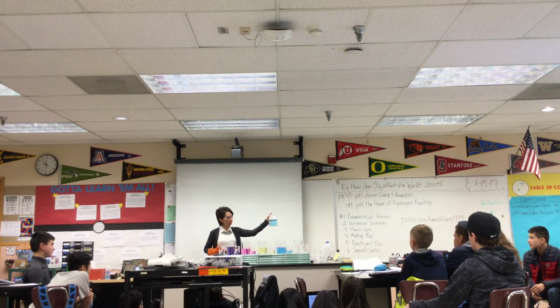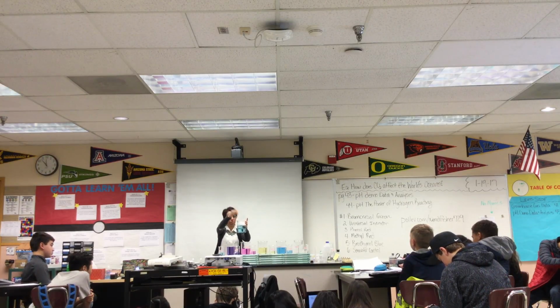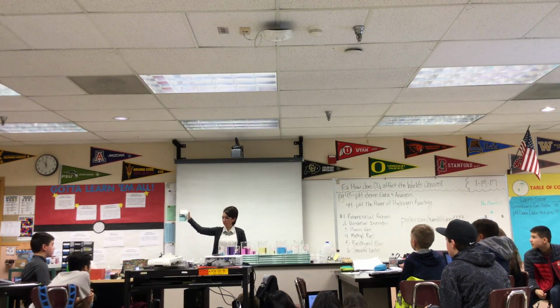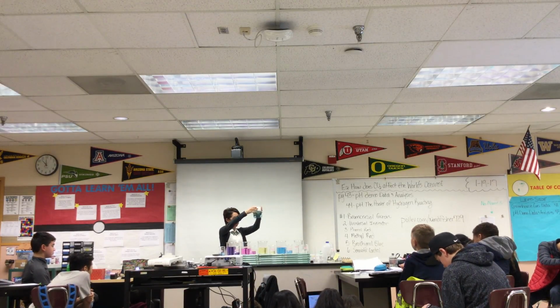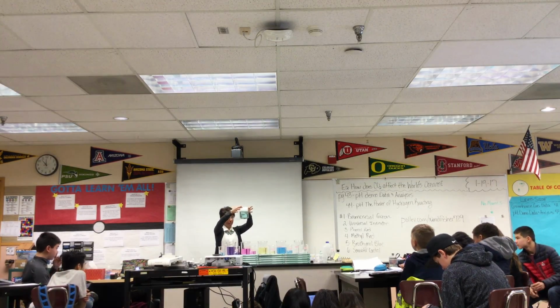What do you automatically see start forming at the bottom? Bubbles. So we can write that down in our during observation. We've got bubbles. What else is at the top? Gas. Like a gas. What do you notice that's happening to the color? It's getting lighter, right? And it may take a little bit of time. But as this becomes more acidic based on your chart, what color should it turn into? Green and then yellow.